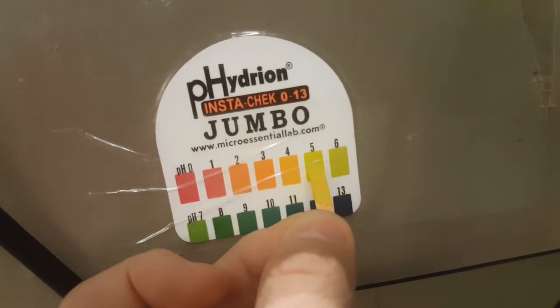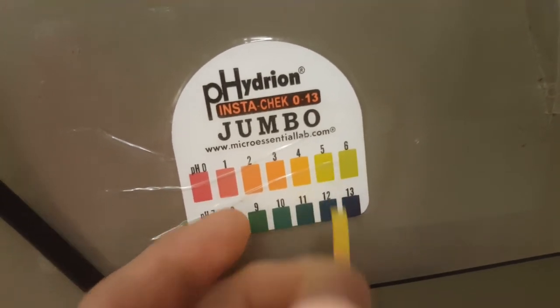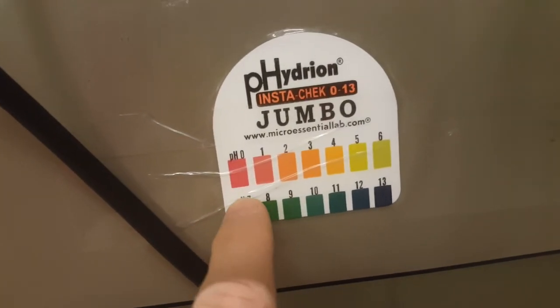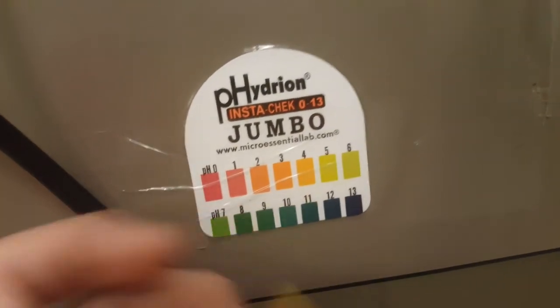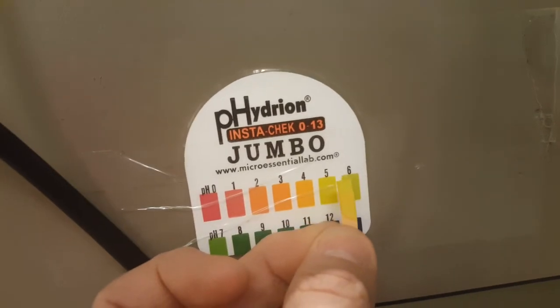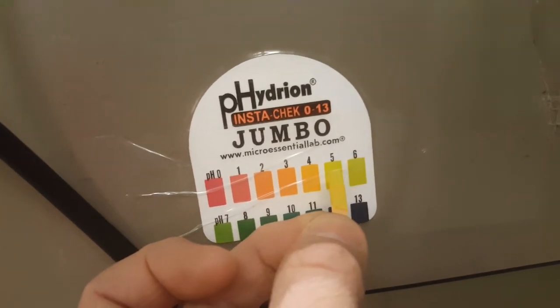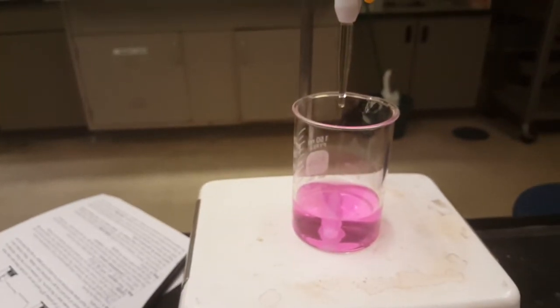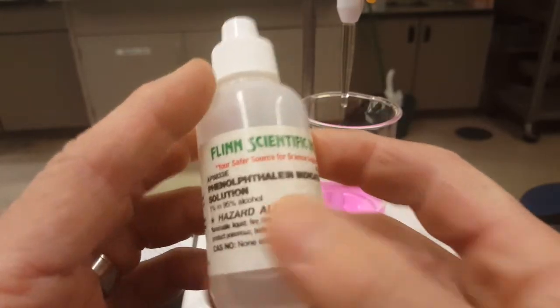Looks like a 5 or a 6. Now equivalency should be at 7 or higher. And this is really close to a 5 or a 6. So I have to make a decision to trust my pH paper or trust my pH indicator.